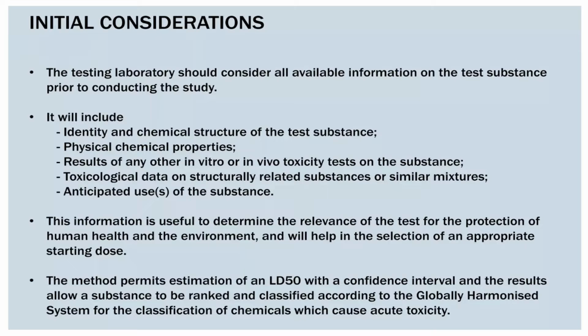Many times what happens, you have a completely new substance. At that time you are not going to establish all this data, but the toxicological level you have to determine by this method, meaning the LD50 dose you can determine by this method. So this method is mainly used for this criterion, the determination of LD50. This information is useful to determine the relevance of the test to the protection of human health and the environment, and will help the selection of an appropriate starting dose.